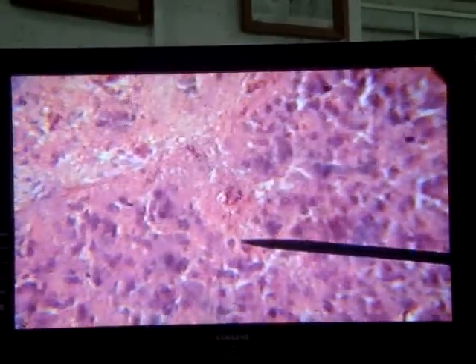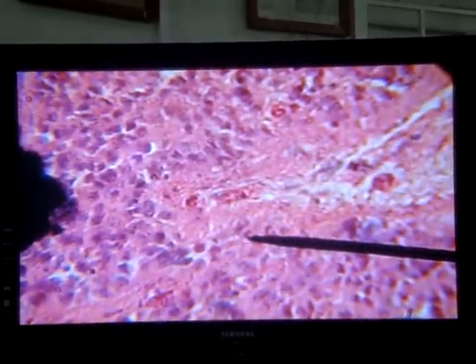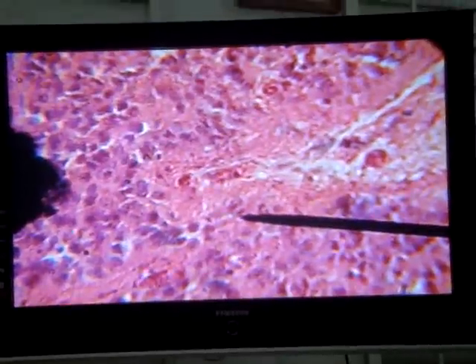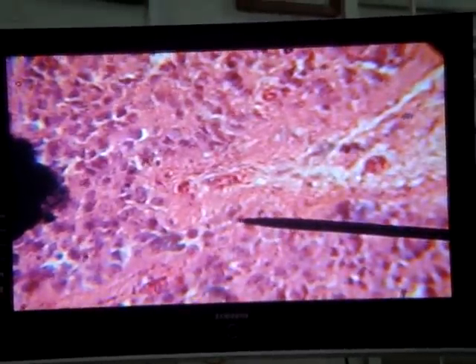Just to complicate life a little bit, let's do something like that. And have the pointer pointing at something all the way over on the other side. So we say identify the structure on the distal part of the field to distract him. So you have to be very observant, right?